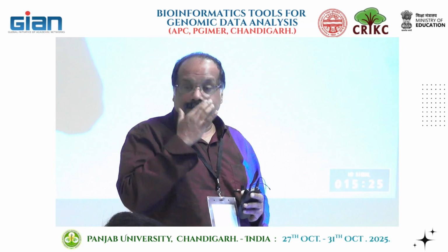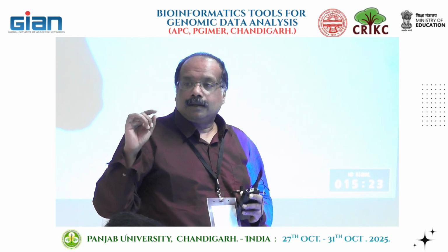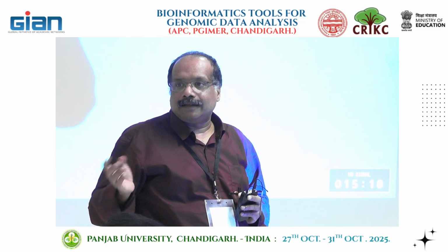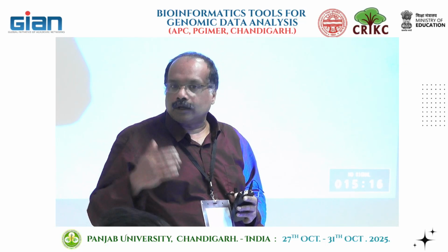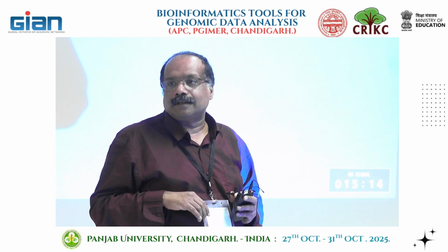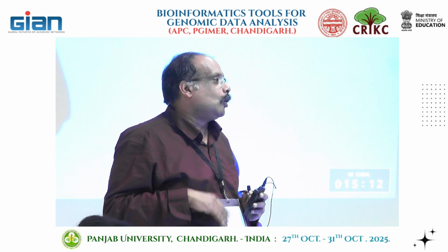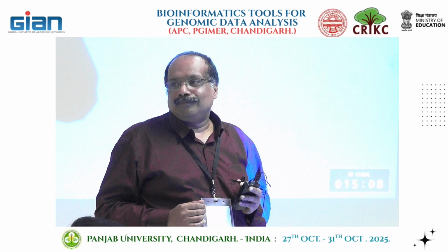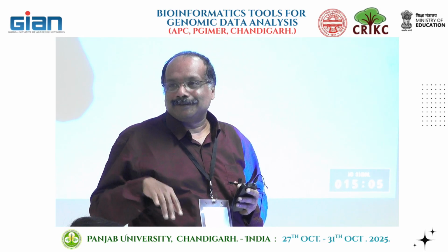Francis is going to start with bulk sequencing: single variant analysis, multivariant analysis, how you incorporate models and how you do various things in that. So a lot of things. Basically, that is the backbone, the main stuff for bulk RNA-seq.